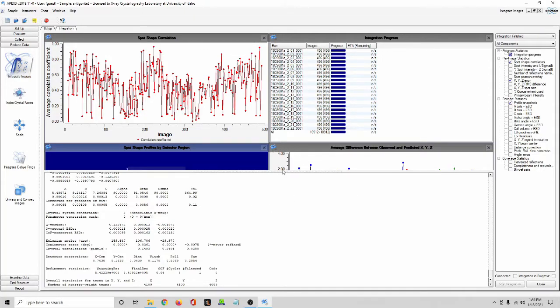So that's why I used it. But yeah, if you're collecting on something you suspect is modulated, transmission electron microscopy can be very helpful, and run relatively long exposure times, because the sublattice peaks are going to be just much more intense than the satellite peaks, and it may drown them out. So it helps to have a high dynamic range on your detector. So just anything more modern would be very helpful.